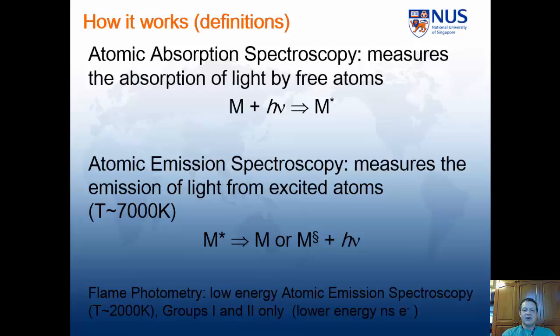It's effectively a very low energy atomic emission spectrometer, and at that energy, probably only group 1 and 2 metals are the only ones that you can usefully detect. And that ties up with, if you remember practicals, you were looking at sodium or potassium, maybe occasionally calcium.